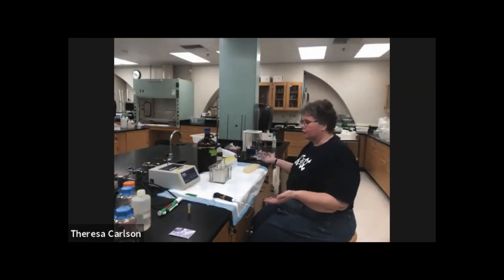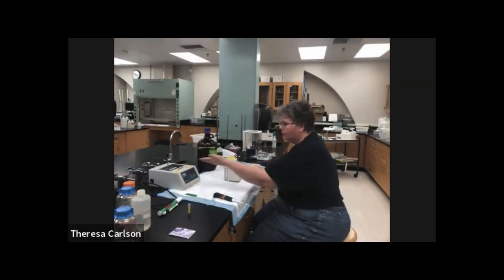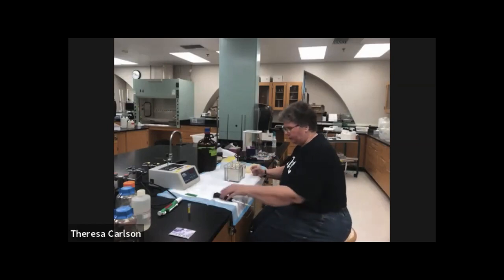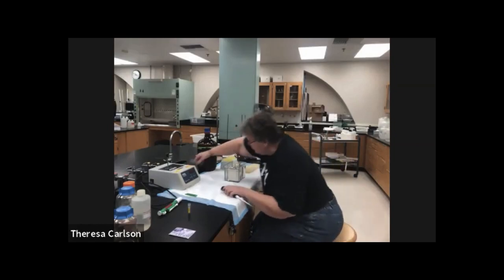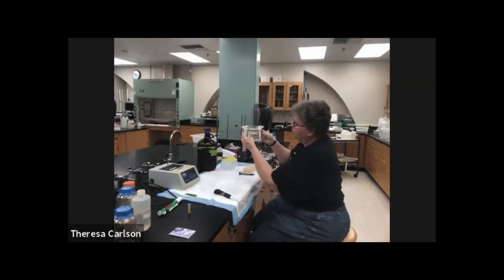If you are working in a group, what can happen is one person can be setting up the gel while somebody else is actually working on the samples. While those are in the 95 degree heat block, we're going to get ready to load our samples. Particularly the first time you're running one of these gels, it can be difficult to see where the lanes are. It just looks completely clear to you.